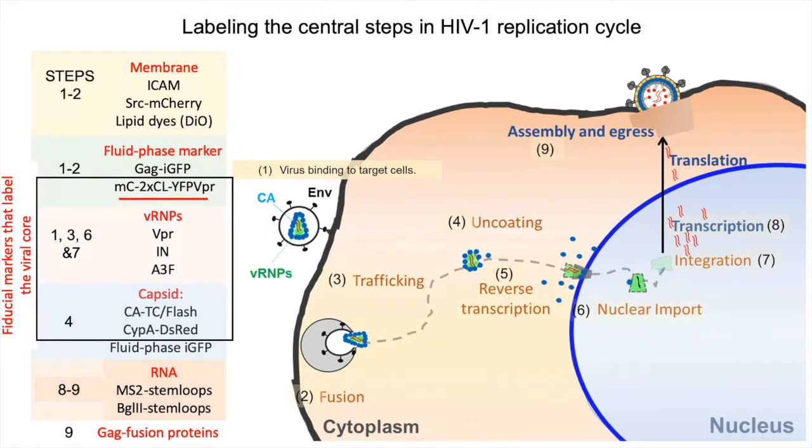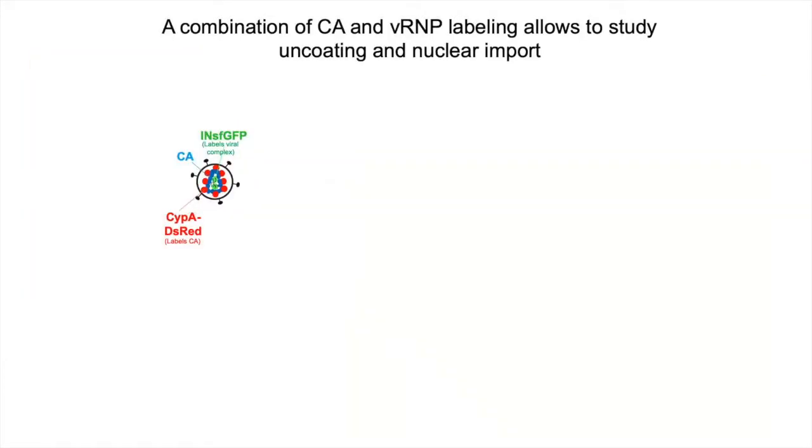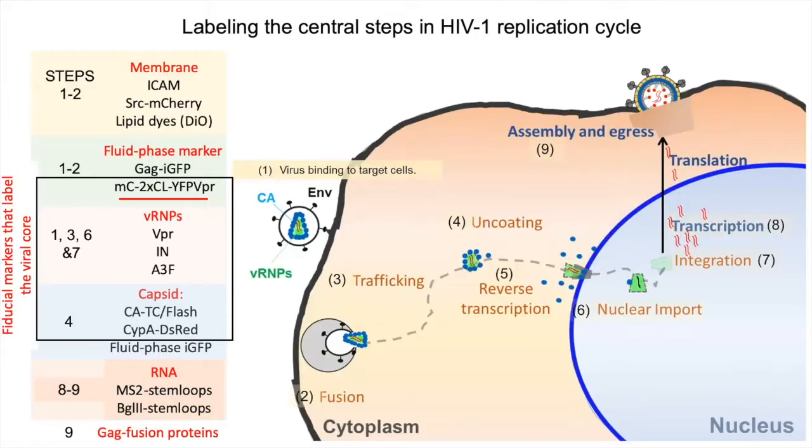And out of these, there are a number of fluorescent probes, and I might have missed some, that remain attached to the viral core. So they remain inside the core, or they are bound to the capsid. They can be visualized for long periods of time as the virus enters the cell and gets into the nucleus, right? So what I've just told you is that these are all single markers, apart from this underlined marker, which is a 2-color marker. Everything else is a single marker.